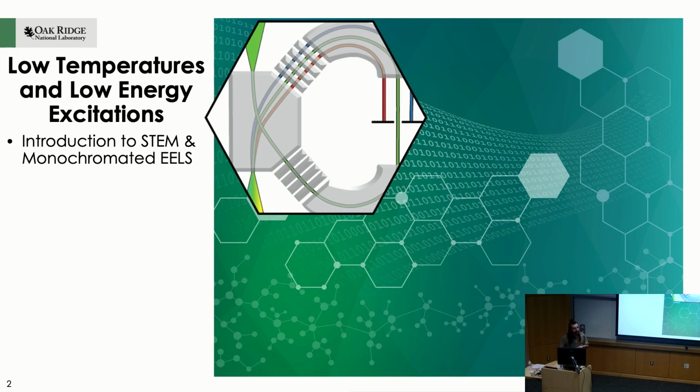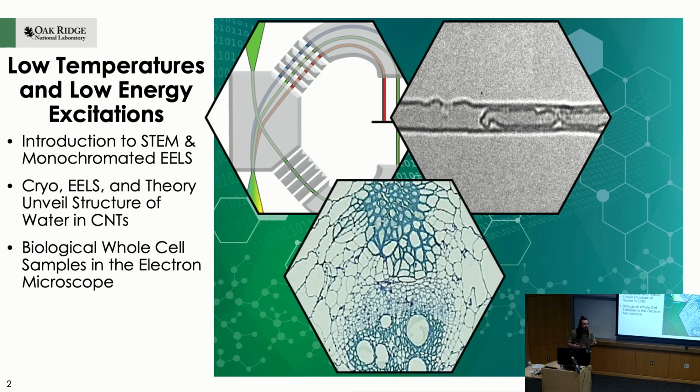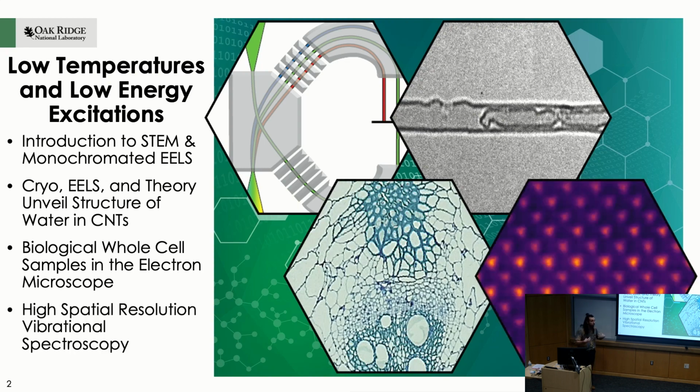As an outline of the talk, I'm gonna go over some of the fundamentals of how monochromated EELS works and how we do it at Oak Ridge. And then I'm gonna go through 3 different topics. First, I'm gonna look at nanofluidics, which is something Matthias and I have in common. I wanted to show you our newest results on this, and that's all really fresh, unpublished stuff that we're very excited about going forward. And then I also wanted to talk about how some of these monochromated EELS experiments could be applied to biological materials and how we can look at whole sample biological specimens and get high spatial resolution analysis. And then I'm going to end up about how we can really take it up to high spatial resolution and do atomic resolution and atomistic analysis of phonons in ceramics and complex oxides.